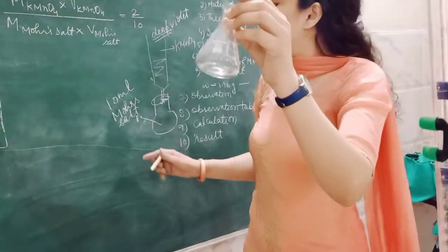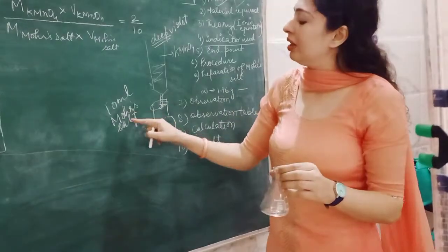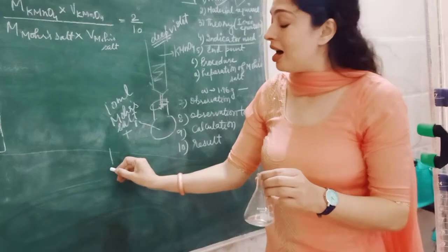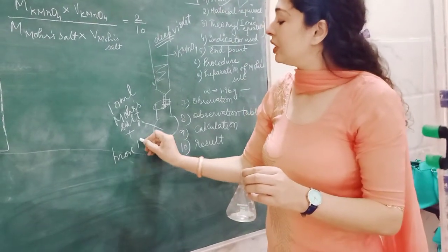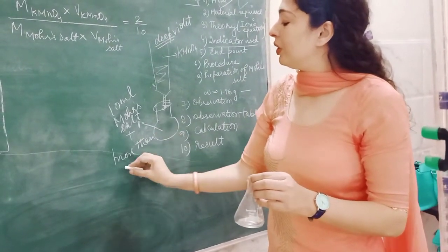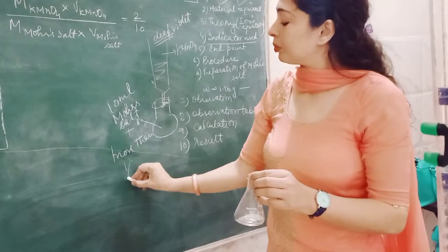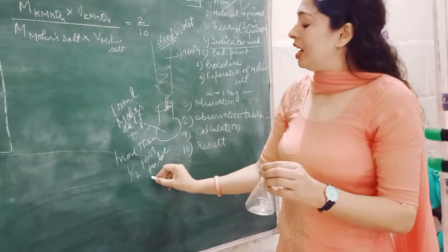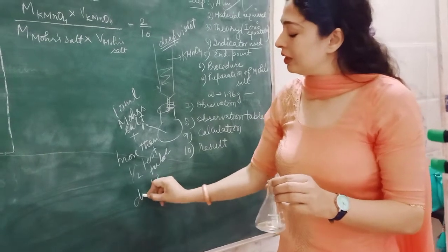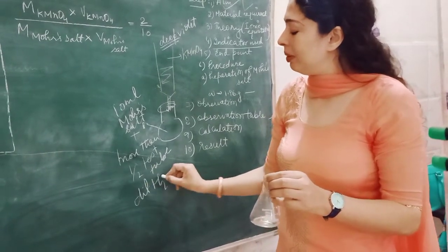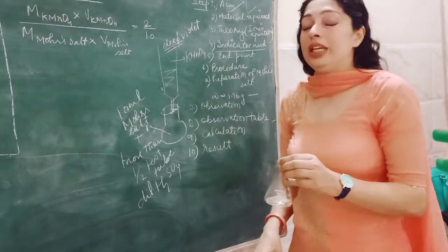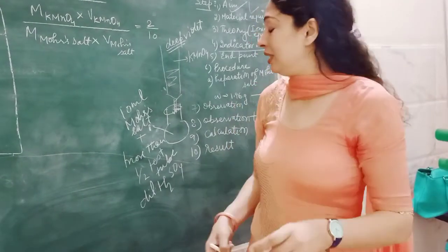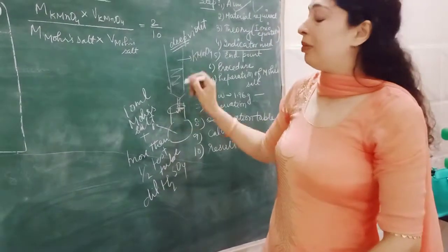What is in the conical flask? 10 ml Mohr salt plus more than half a test tube of dilute sulfuric acid. You will get the reagent bottle of dilute sulfuric acid and also get the KMnO4 to fill the burette.